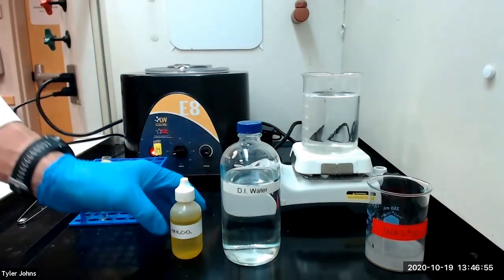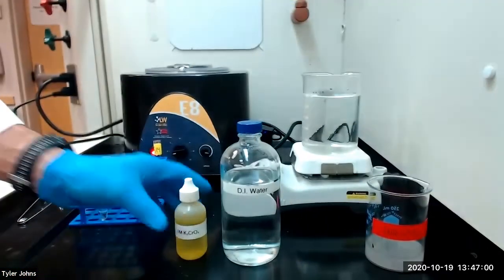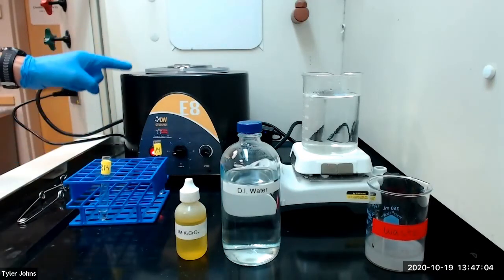We will next add three drops of one molar potassium chromate to our solution. We will then warm and agitate the mixture and centrifuge.